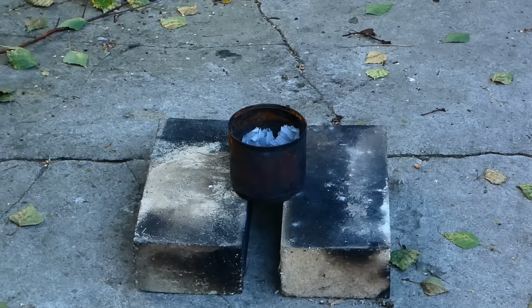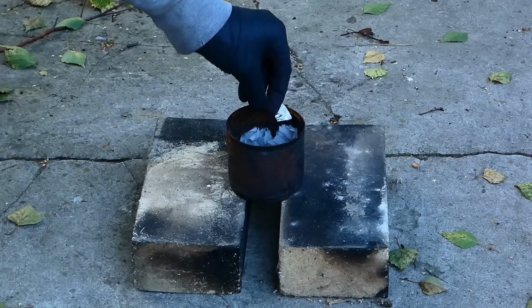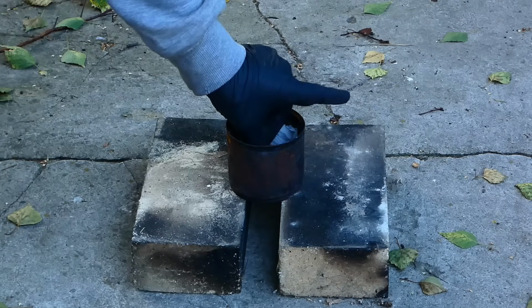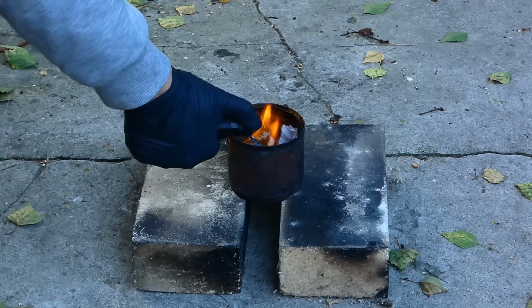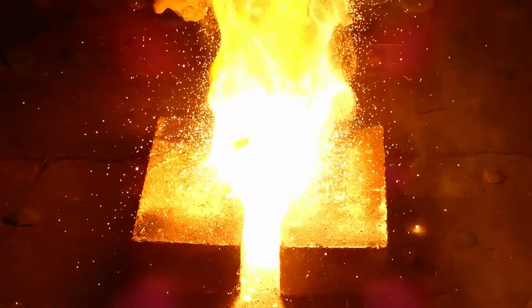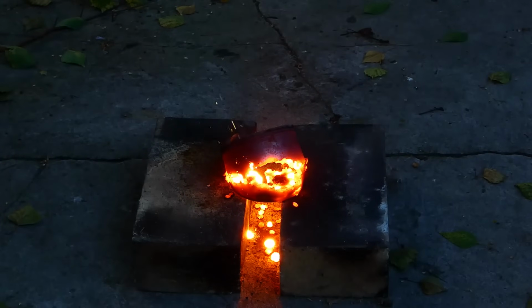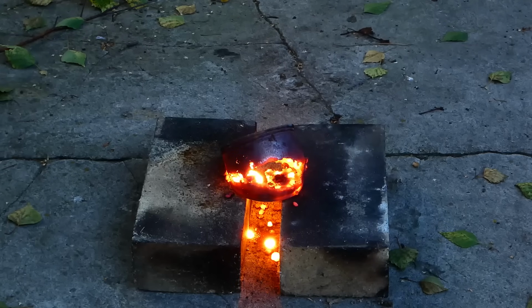It is very hard to ignite, and to get it to burn, I had to use a piece of magnesium metal. Once ignited, it burns very vigorously, looking like some kind of volcano, and like a volcano, it is very hot, which resulted in my steel can being completely melted.